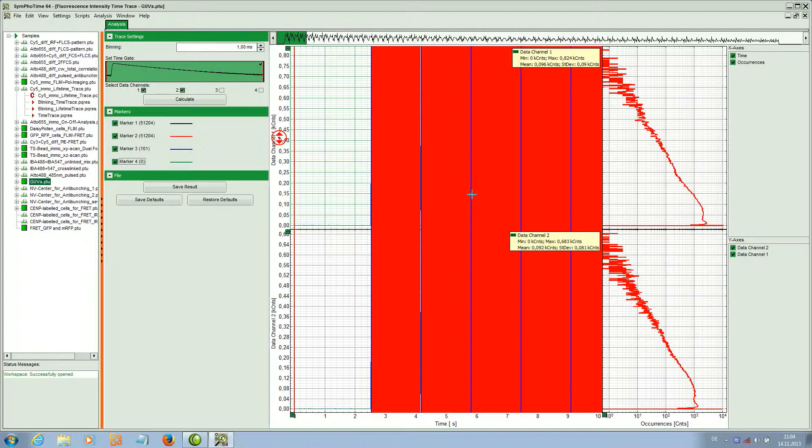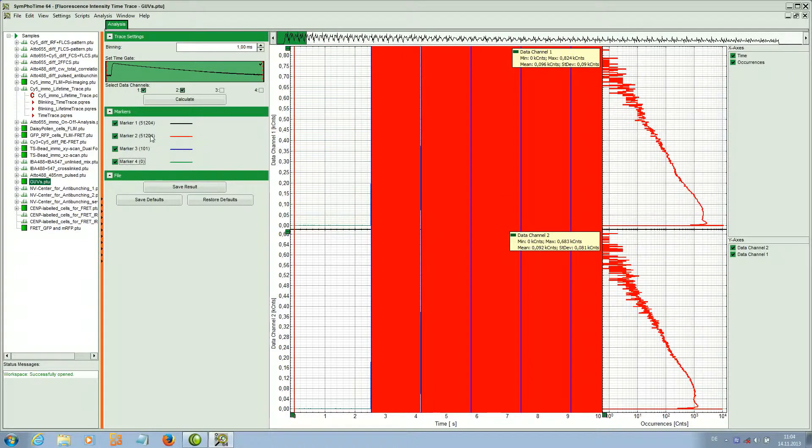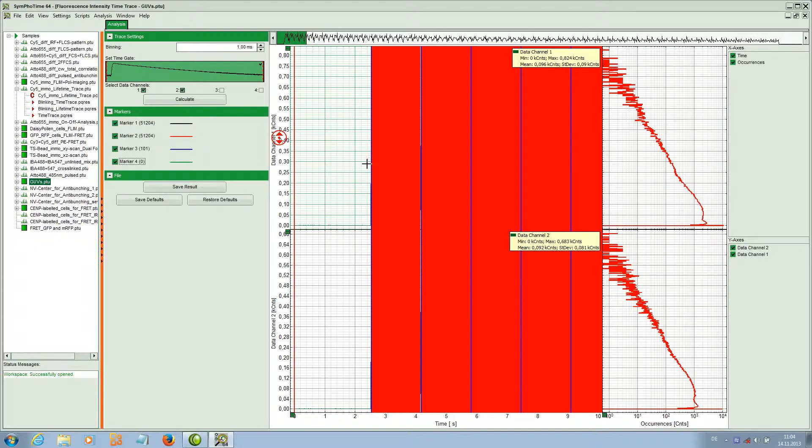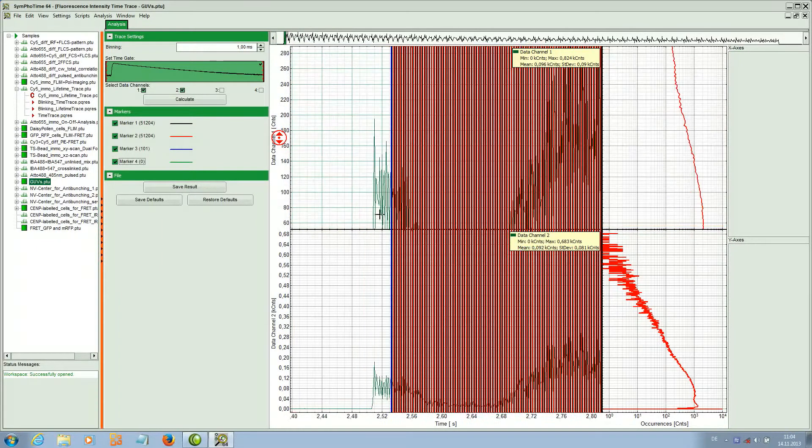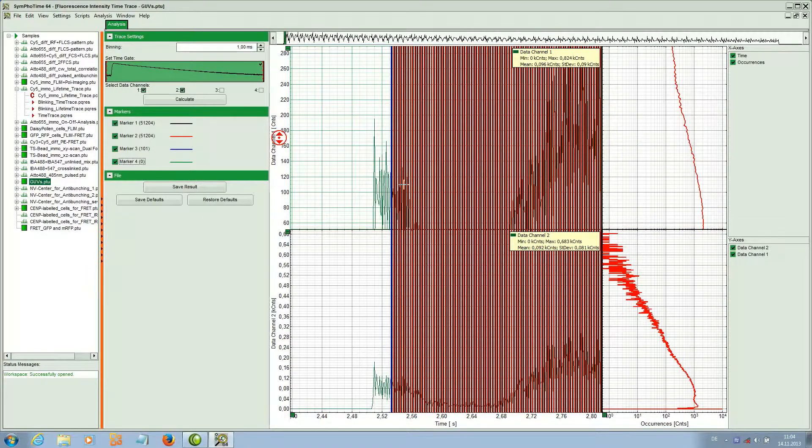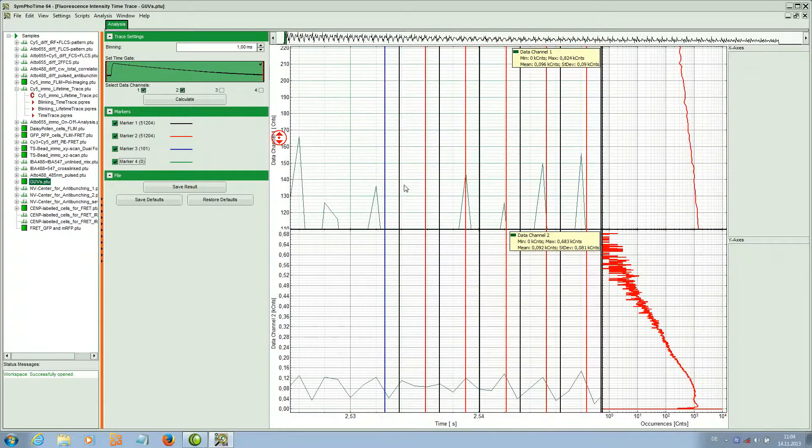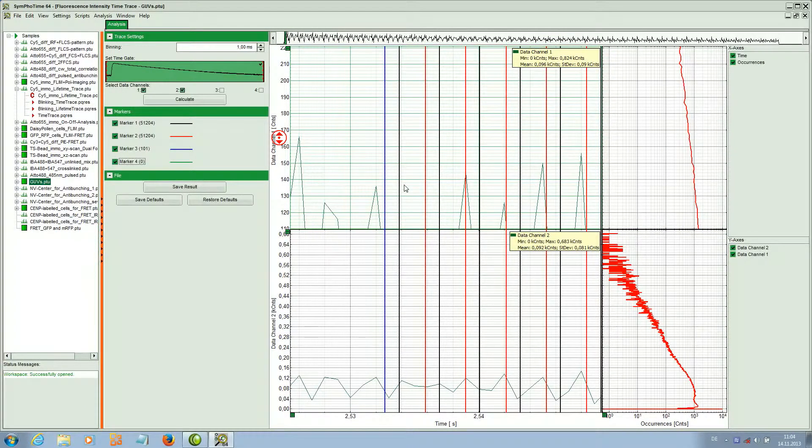Between each blue line we have a new frame and the line markers are so close together that you can't really see them. That's why I have to zoom in here. They start to become visible and now they are nicely separated.